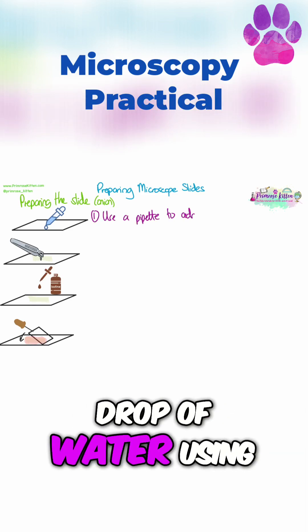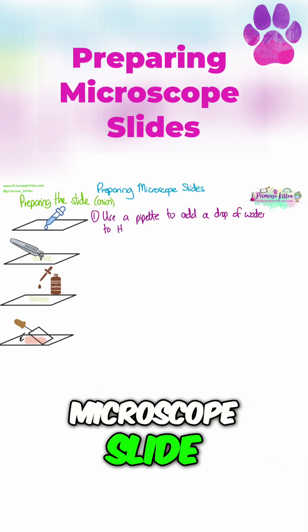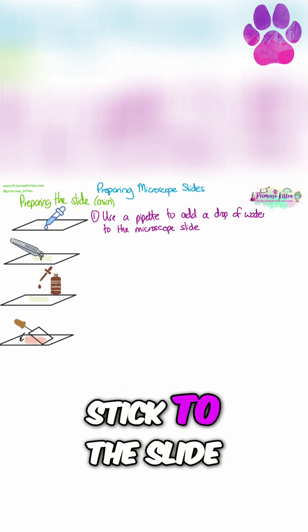So the first step is to add a drop of water using a pipette to your microscope slide. This is just going to help your tissue stick to the slide.